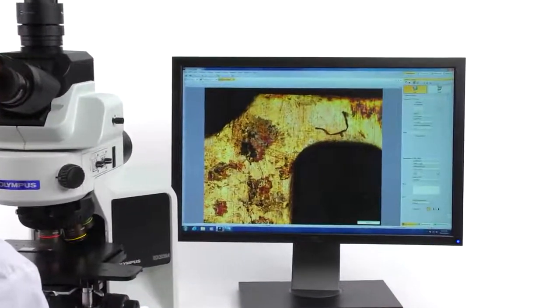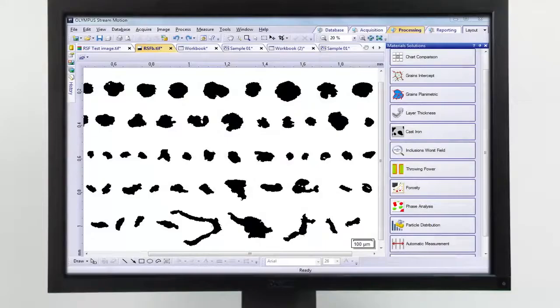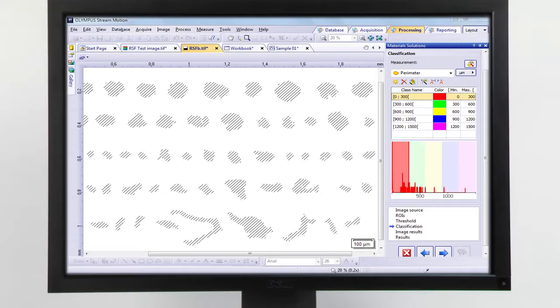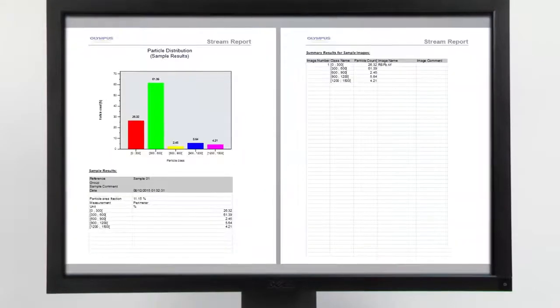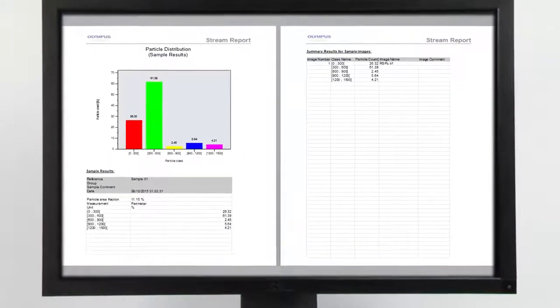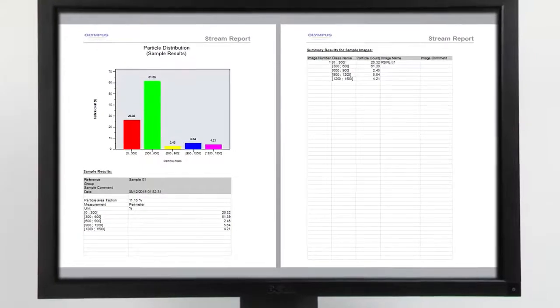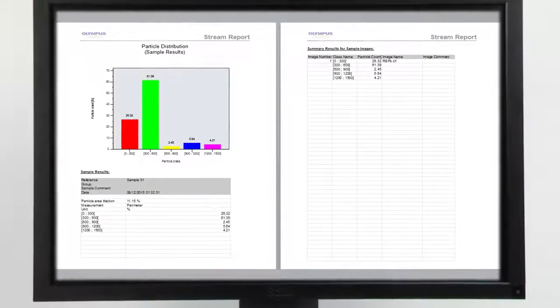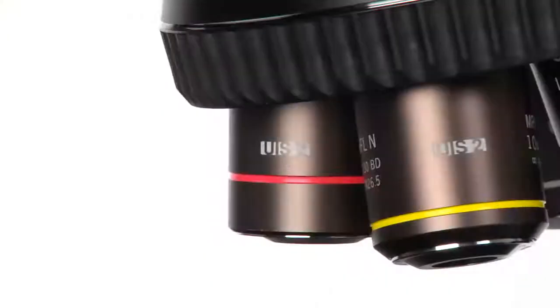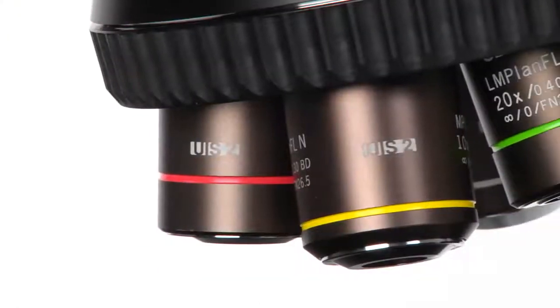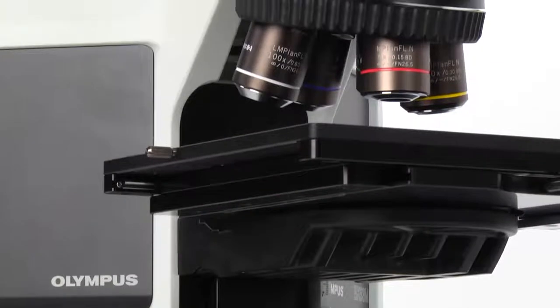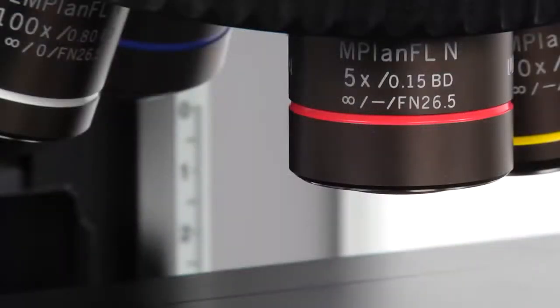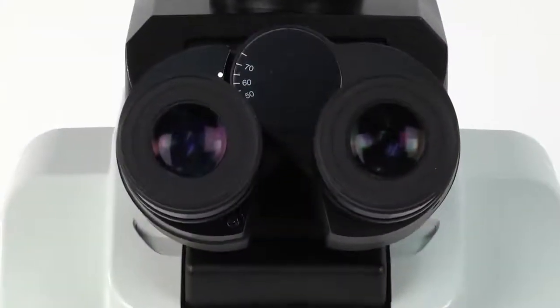Users can seamlessly acquire, process, and measure images. In addition, users can create reports with the touch of a button. Our leading-edge optics are engineered to provide advanced performance and durability. The BX3M series provides excellent observation methods.